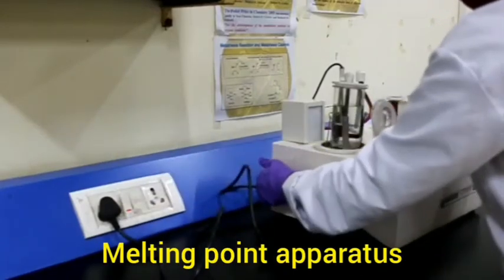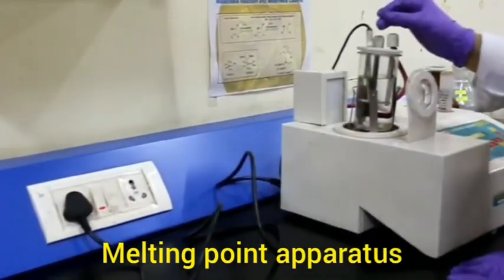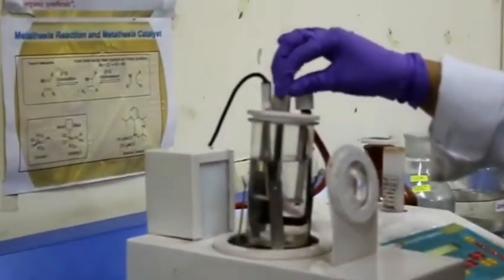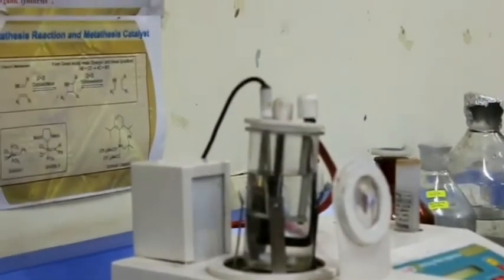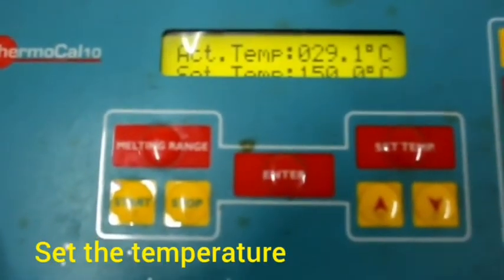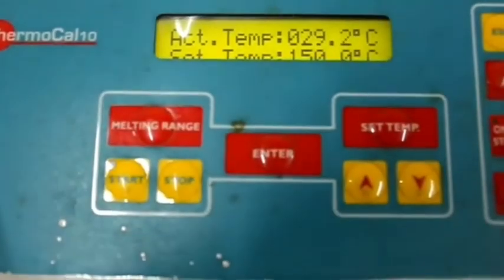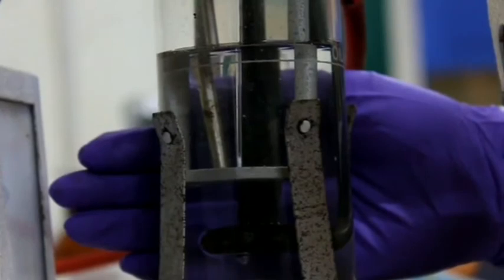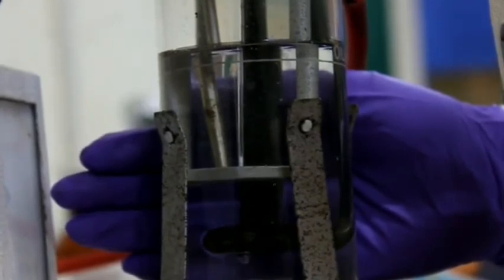Then we are switching on the melting point apparatus and inserting the capillary tube into the heating oil through a slot, turning on the stirrer and heater. We set the final temperature at 150 degrees centigrade. For a clear view of the tube, we hold one hand behind the heating chamber.